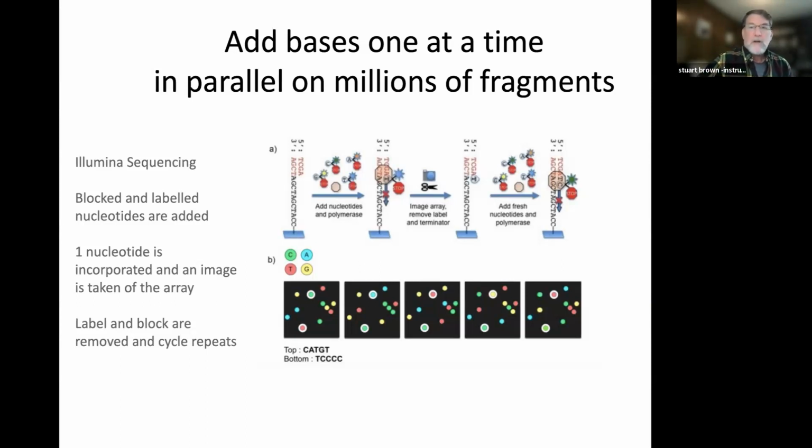But another feature of Illumina sequencing is that chemistry is being conducted on millions or hundreds of millions of spots simultaneously, and there is some imperfection. It's 99.99% perfect, but some spots don't get a base added, don't have the terminator cleaved, something goes wrong.